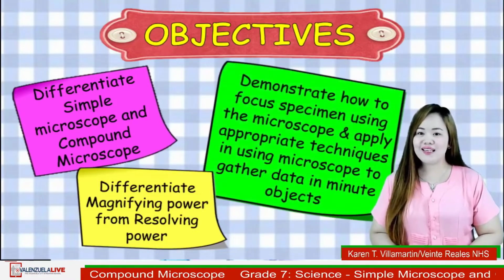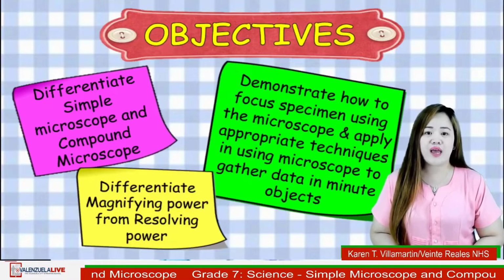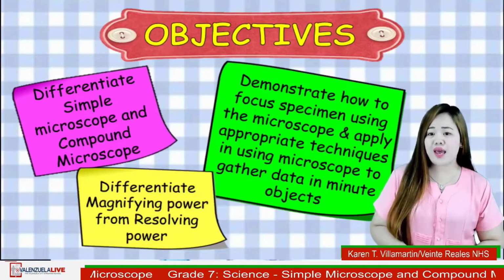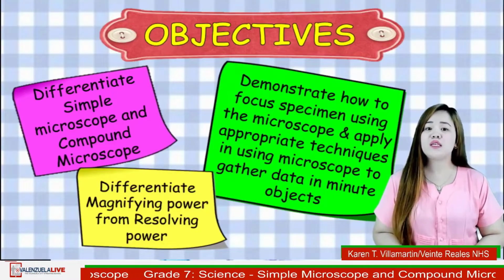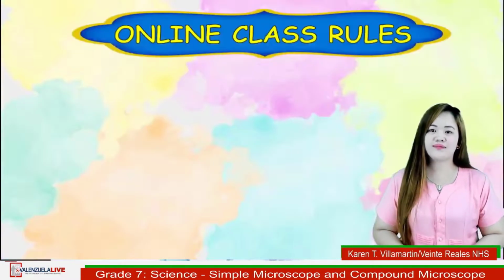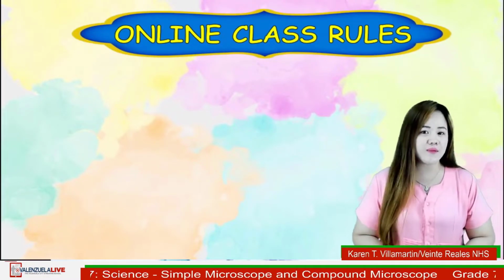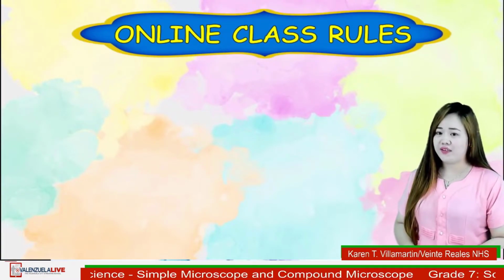And lastly, demonstrate how to focus a specimen using the microscope and apply appropriate techniques in using microscope to gather data in minute objects.